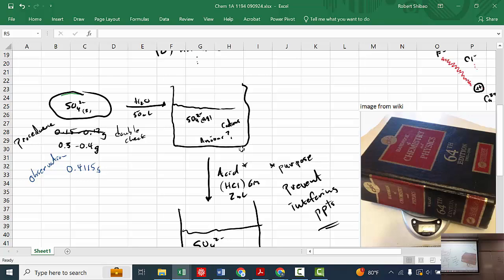And then what I'm going to do is let it cool in this thing. You know what this thing's called? A desiccator. I'll just grab these with a tong. Hopefully these aren't too rusty and a rust chip doesn't fall in there. So I'll cool this off in here and then just replace the lid.